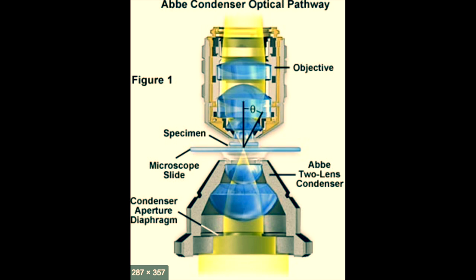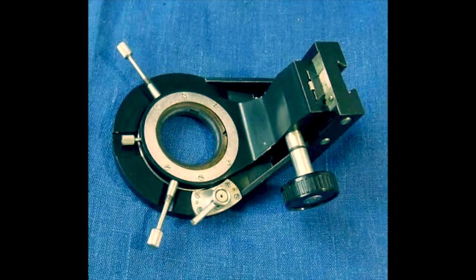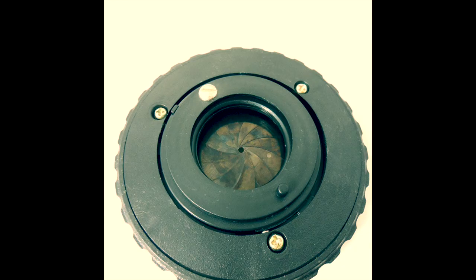The Abbey type condenser is a two lens system in which the light is condensed onto the specimen on the stage and in doing so ensures adequate illumination for our viewing. A detached condenser and iris diaphragm system looks like this with a lever to change the illumination via the iris diaphragm and an adjustment knob to change the height of the condenser which must be lowest for the 10x objective lens, mid position for the 40x lens and the highest position for the oil immersion lens. Here the iris diaphragm is completely open while in another view from below the iris diaphragm is completely closed.